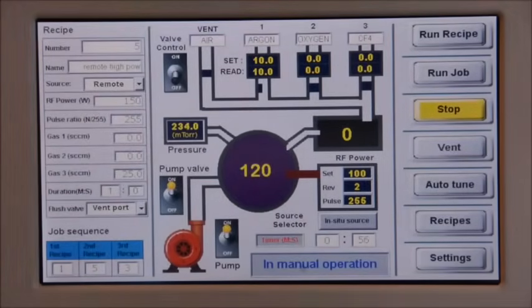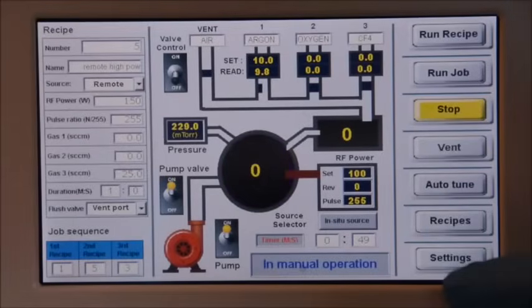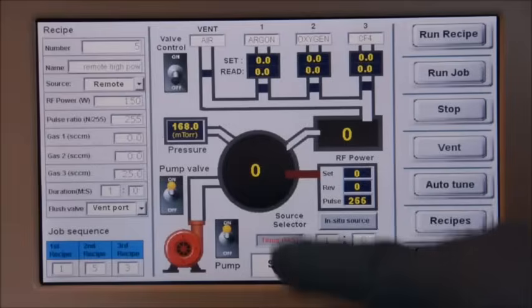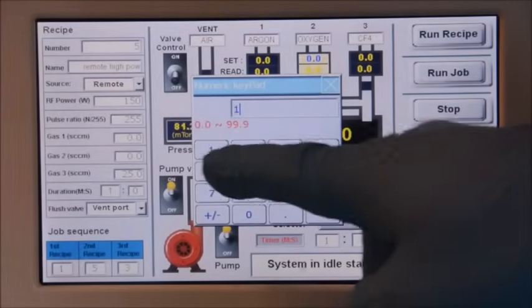The number in the middle of the plasma source indicates the plasma strength. Clicking the stop button will end the current process immediately. The user can also manually switch between immersion mode plasma cleaning and downstream mode plasma cleaning by clicking the source selector button.